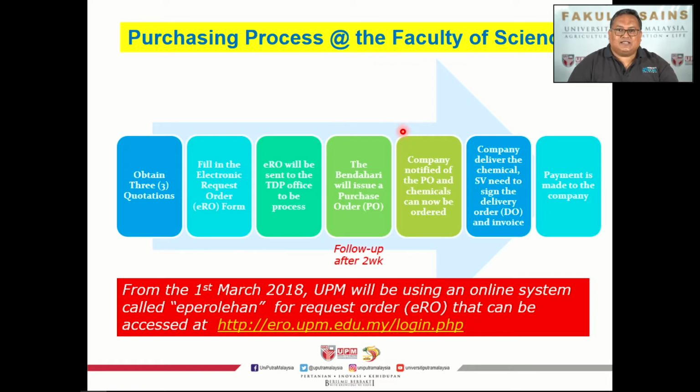Maybe in 6 months' time, you know that you'll be doing a certain experiment, so order your chemicals beforehand. Don't buy the chemicals on the day that you want them. This is because in Malaysia we don't have a lot of companies that actually produce chemicals. Most of our chemicals have to be imported, so it will take time. Okay, so that's the topic on purchasing at the Faculty of Science.